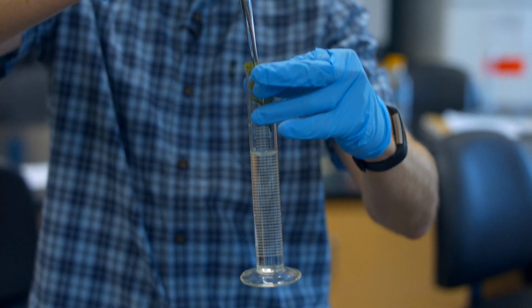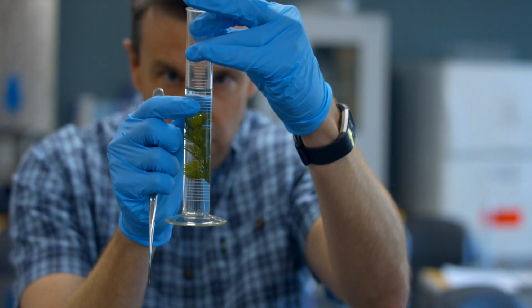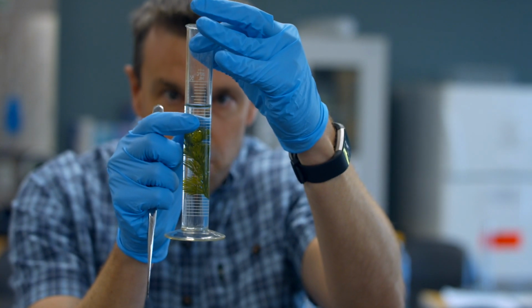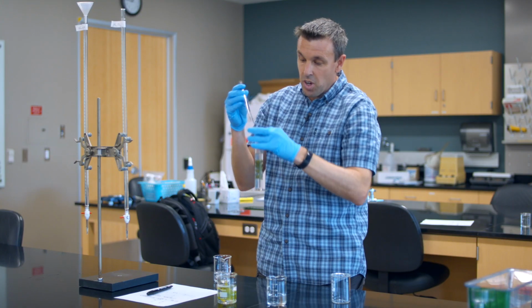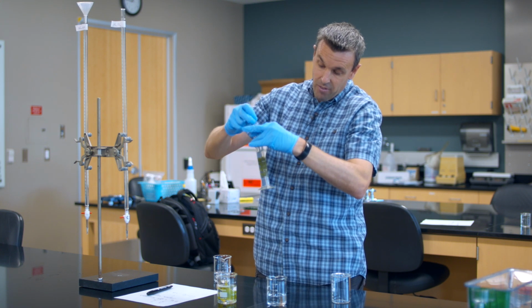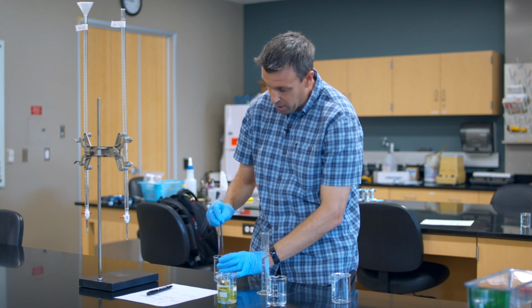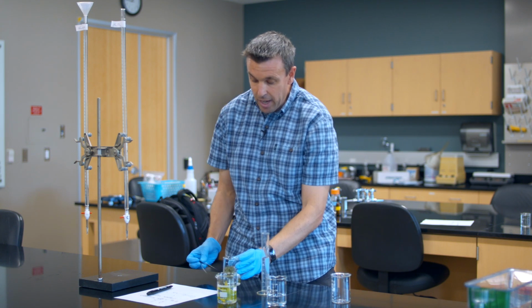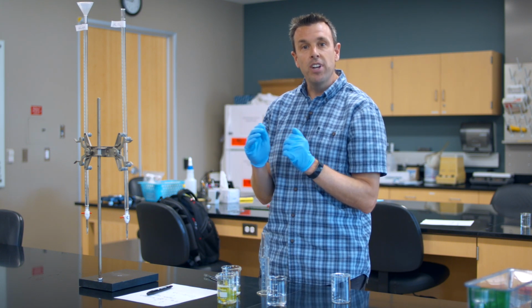So then I am going to insert my plant. And I can see that that water level has risen to 41.4 mils. So this is 1.4 milliliters of plant. So I would want to make sure that I'm getting the same amount of plant for all my different groups. I would then have all my beakers with the same amount of plant in them. We would let that go under whatever conditions you've decided to test for a half an hour.